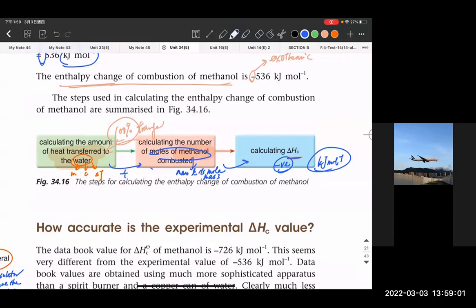So the classwork, your further work, is to check the following. First of all, any further improvement on the calorimeter of this burning experiment. Tell me. Second, I will show you parts and you tell me the function of the parts, which will help you get the answer. Third is to give you one calculation, and I would like to check how you approach the calculation clearly. Okay, only two questions. I would like to check that too.